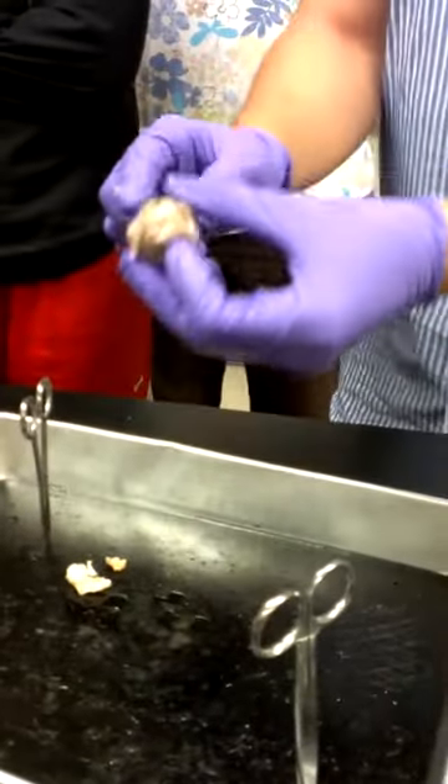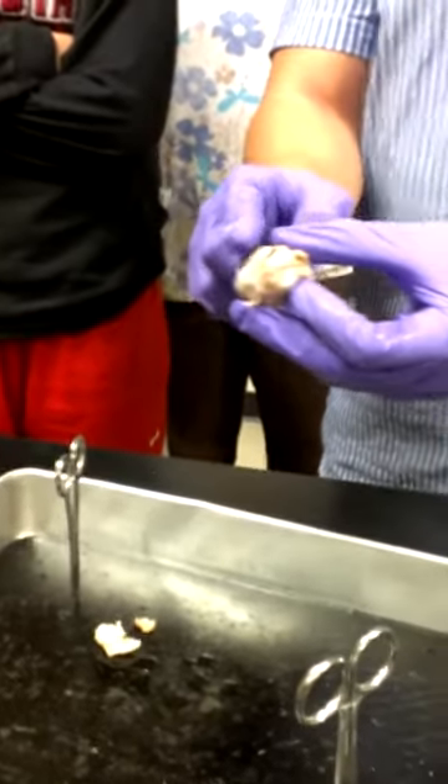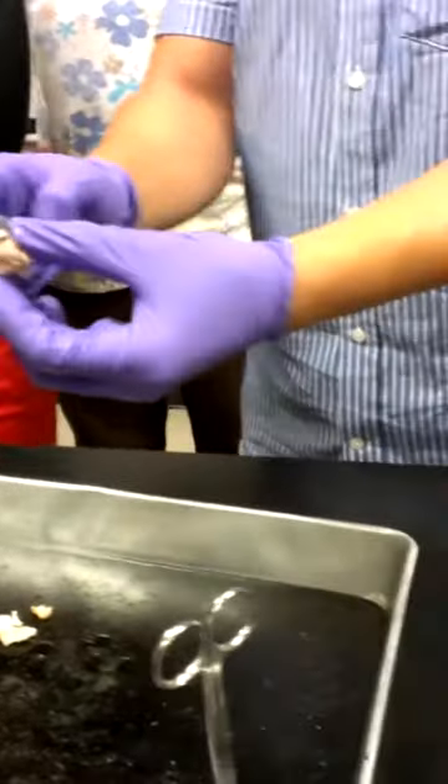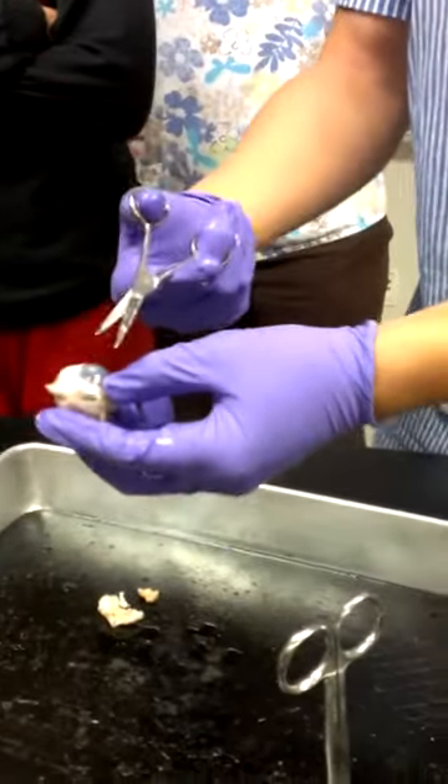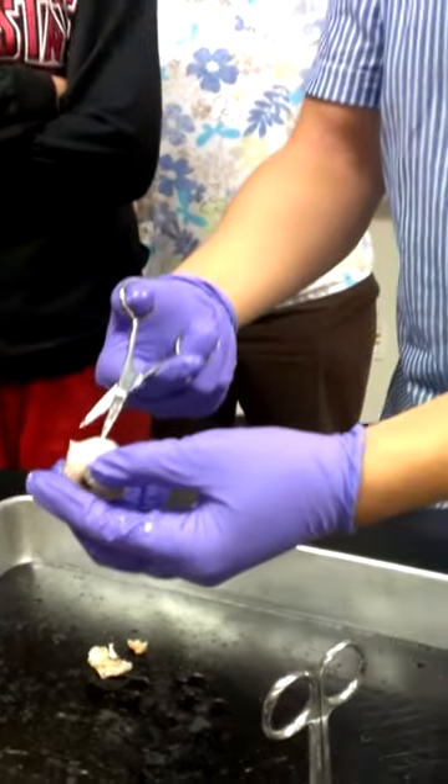So the first thing outside when you look at the eyeball is going to be the cornea. What's the white part called? The sclera, right. And because it's a dead eyeball, you can't see the changing color of the iris and stuff.